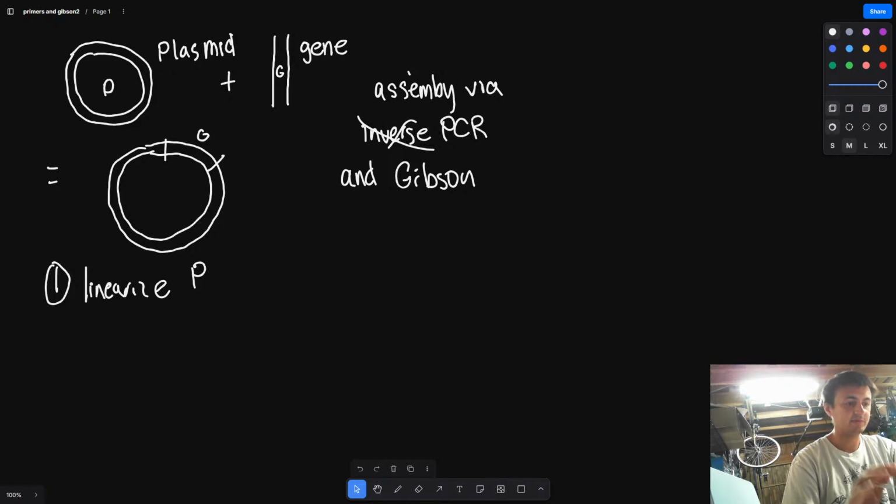I think you might be able to get away with not in this video, but some things might be confusing. So first off, this is mostly going to be a lesson in directionality, because the directionality of DNA is kind of the most important part about figuring out how to do all these things.